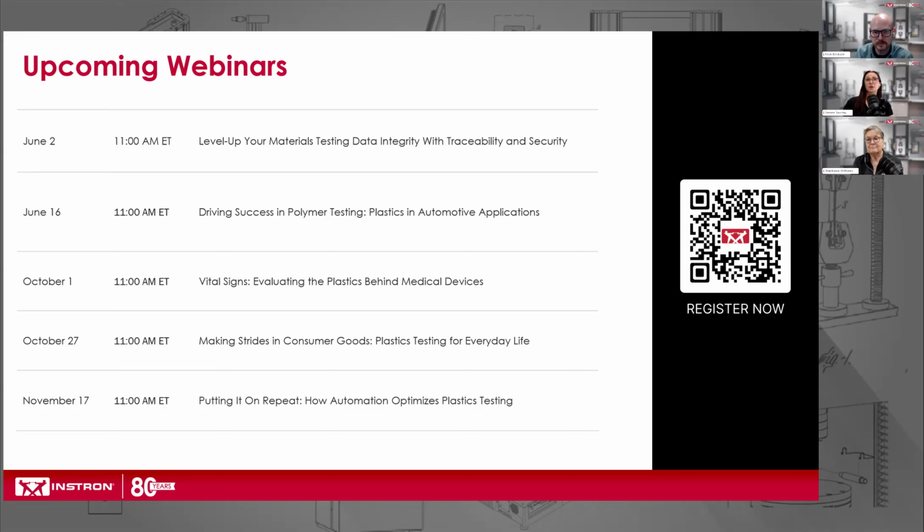Yeah, so I could take this. If you're running a static test, ultimately where you start is making sure, for static tests, of tension and specimen alignment, visually aligning your specimen like we talked about briefly in this webinar. I would also ensure that you're running with powered grips. If you're not, maybe your operators are clamping the grips at different tightnesses, which will lead to some variability within your data. Those are the two main things I would start with. And then again, like we mentioned so many times, read the standard and make sure you're compliant with it.